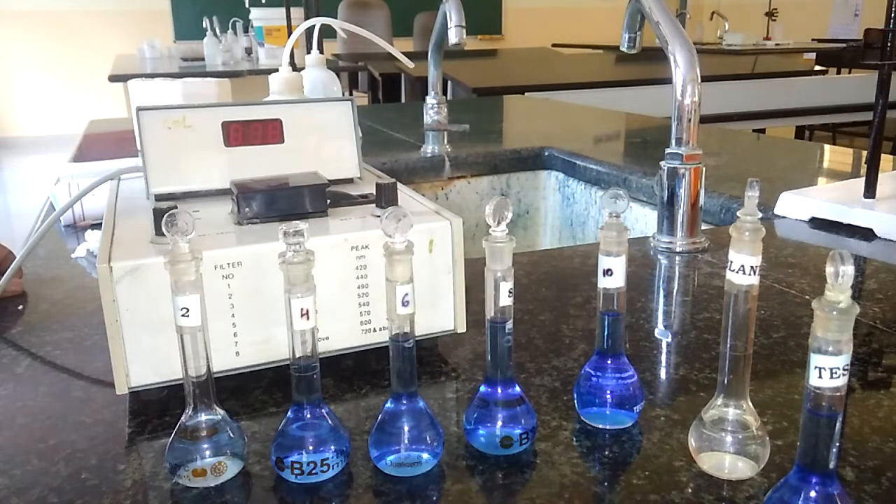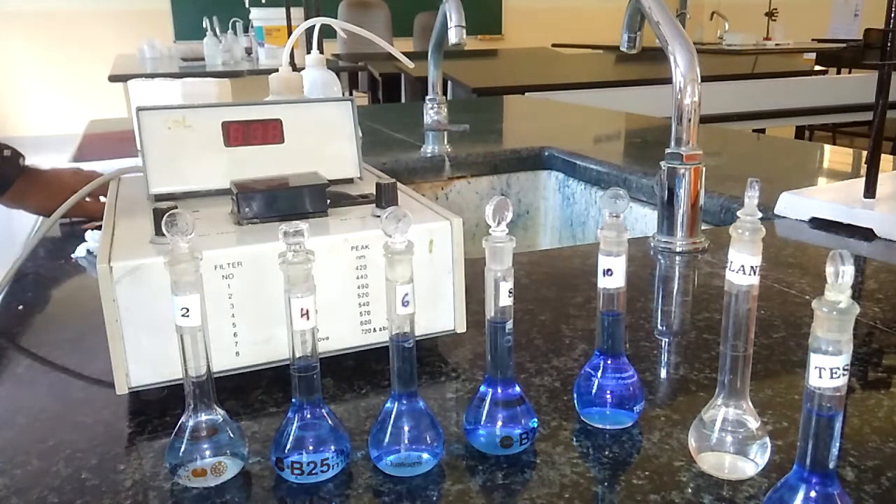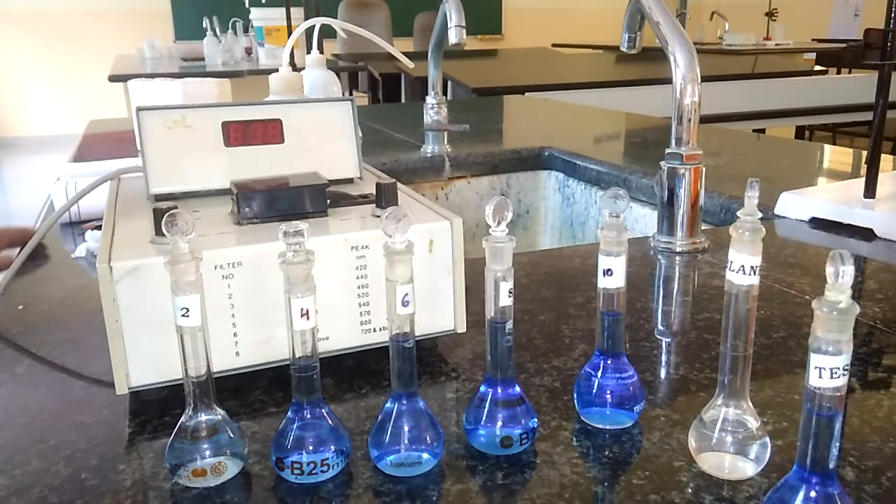Today, I am going to give you the demonstration of a colorimetric experiment. The title of the experiment is colorimetric estimation of copper in copper sulfate. For this, we need some devices and chemicals.